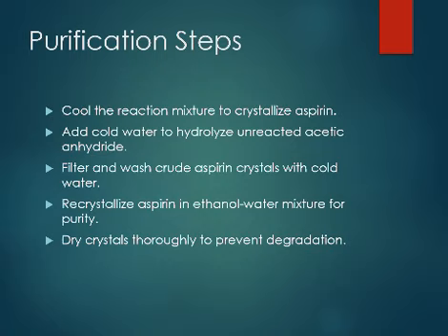Cold water is added to hydrolyze unreacted acetic anhydride. It is then filtered and the crude aspirin crystals are washed with cold water. Aspirin is then recrystallized in an ethanol water mixture for purity. Dry crystals thoroughly to prevent degradation.